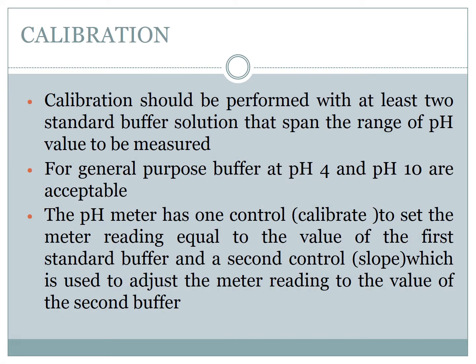Next is calibration. First of all, do you have any idea what we mean by calibration? Calibration is when we compare the reference solution with the standard one. That is all about calibration.